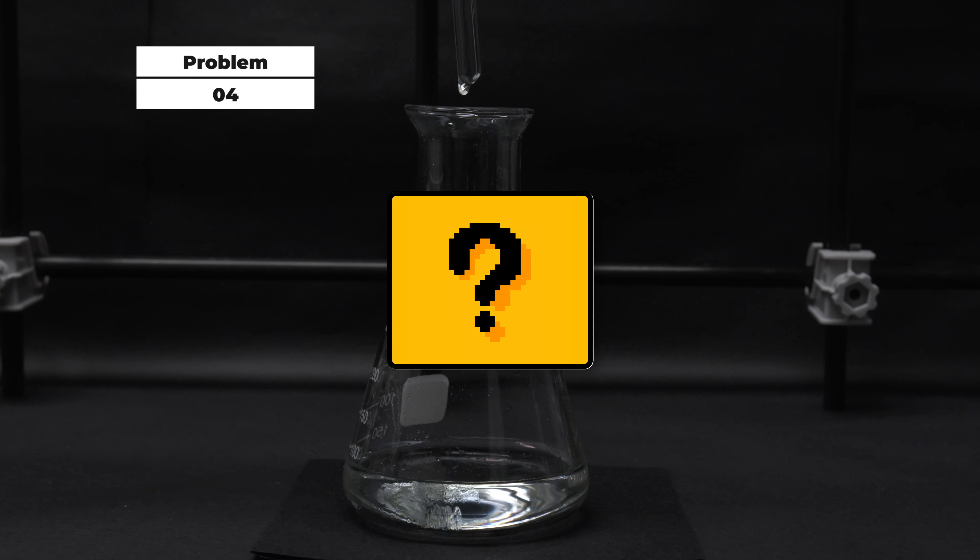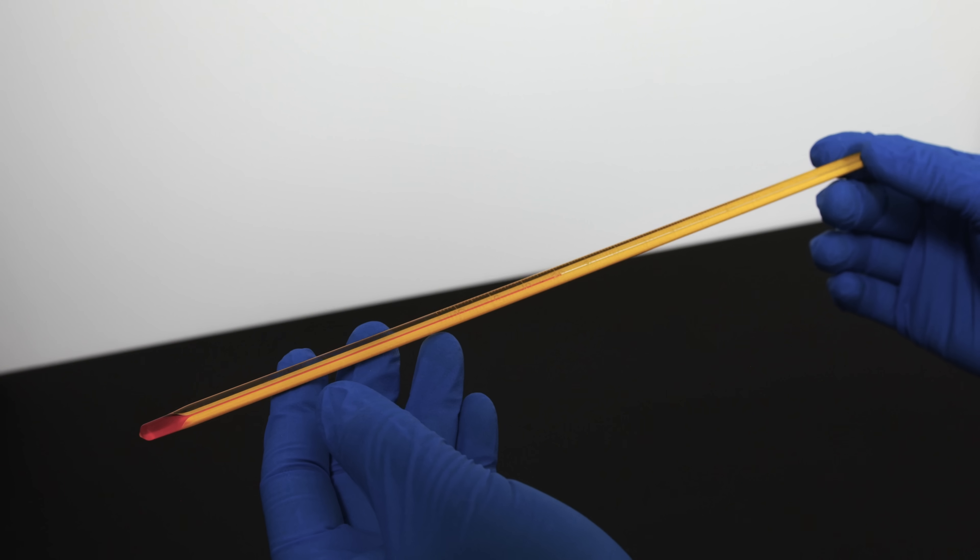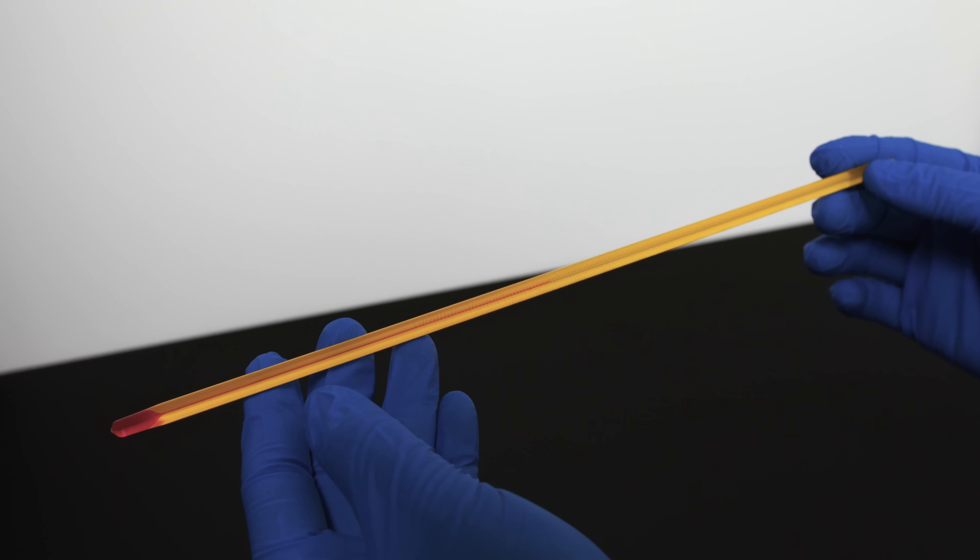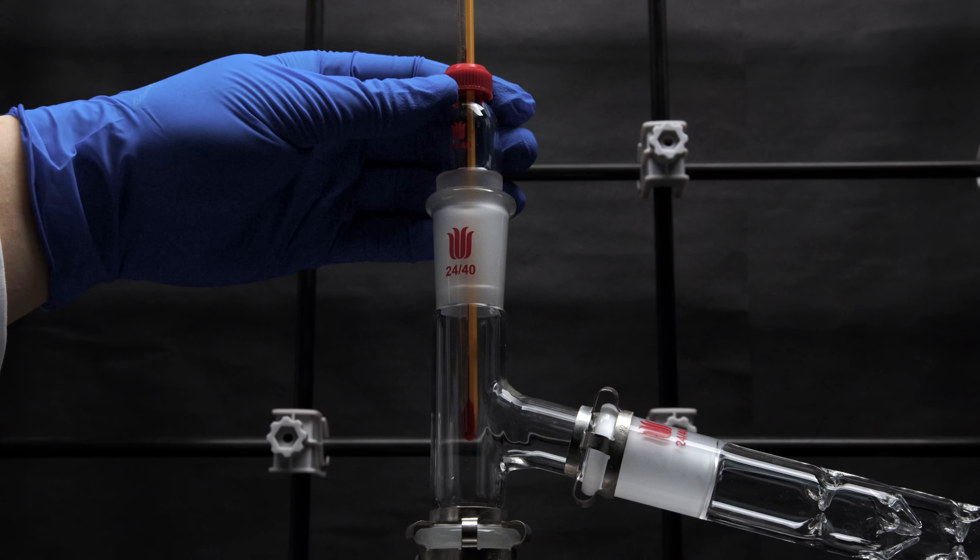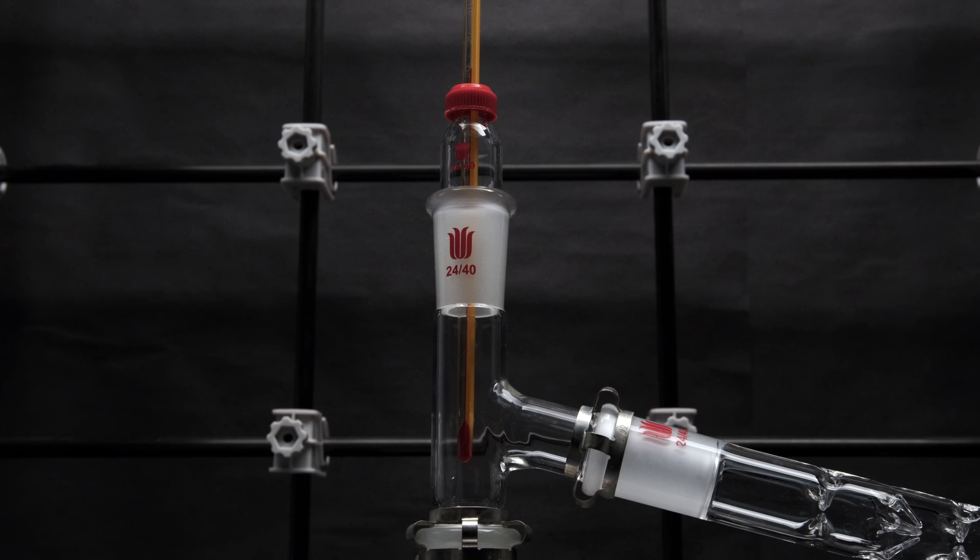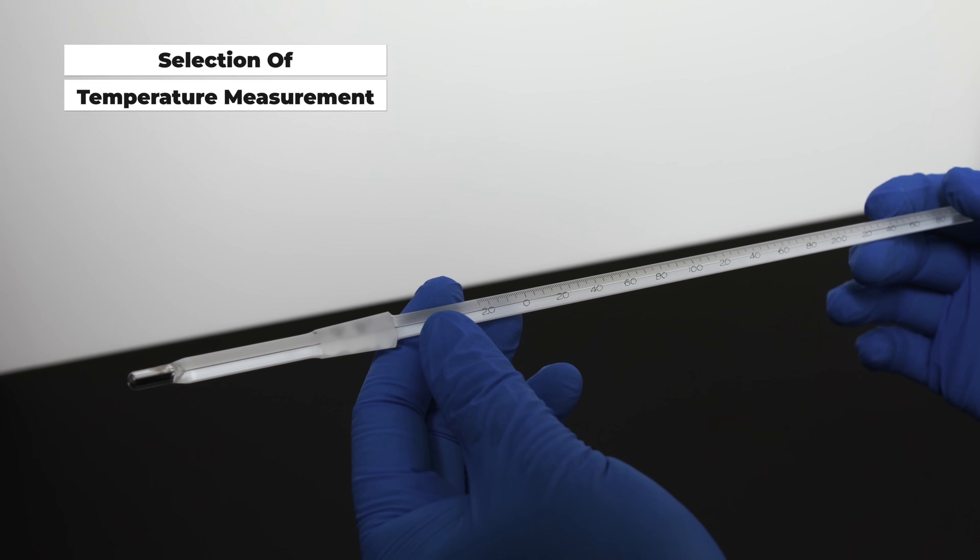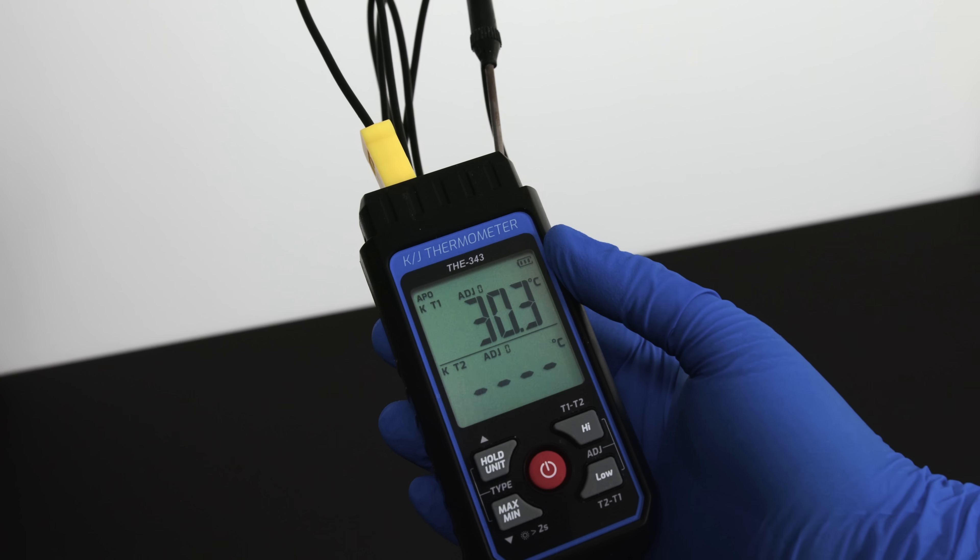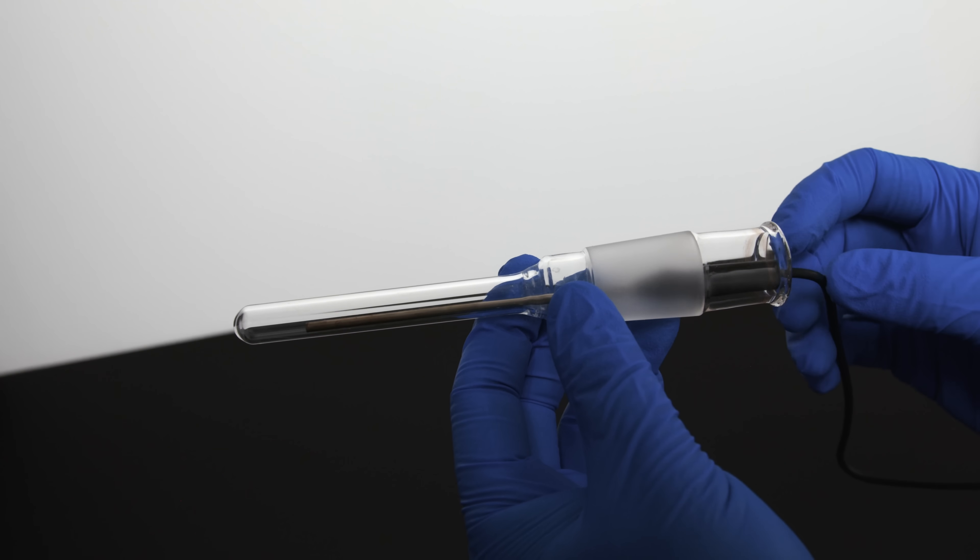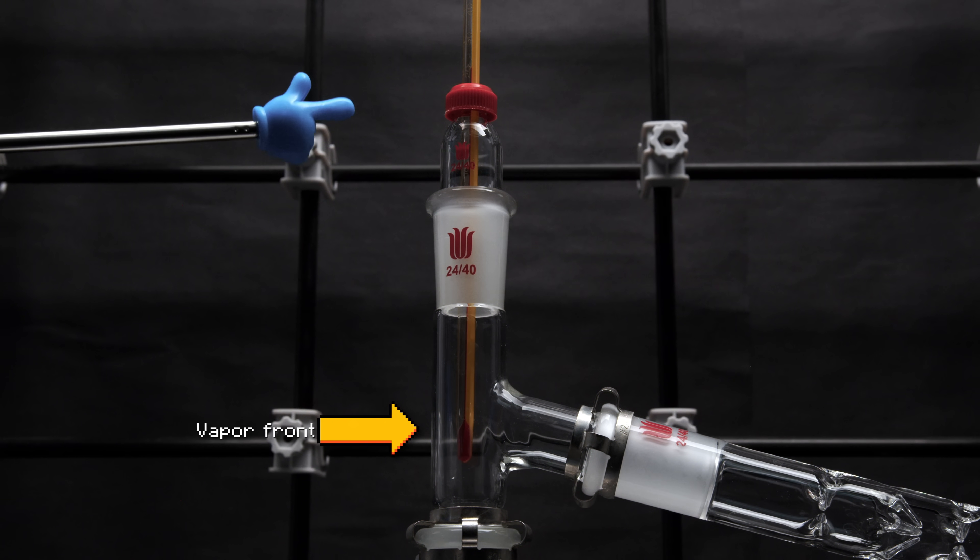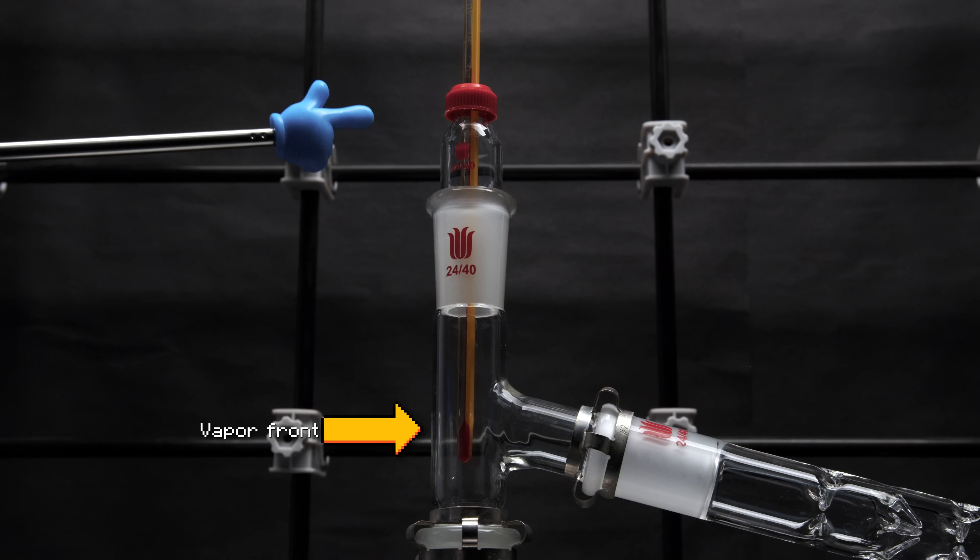Okay so here is the last problem, problem number 4, which is the timing of collecting the distillate. In a typical distillation setup, we use the thermometer to measure the vapor temperature to determine when to start collecting the distillate. But for concentrated sulfuric acid distillation, it's a bit tricky. Since it is boiling at 337 degrees Celsius, the instrument that can be used for temperature measurement is rather limited. You can either use a mercury thermometer or a thermocouple for the temperature measurement. The tricky part for this component is usually getting the right glass jacket for the thermocouple. Also, I should note that a plastic thermometer holder can actually be used in this setup, because the vapor front of sulfuric acid will not reach the top end of the holder, so it will remain relatively cool and the plastic cap won't melt.